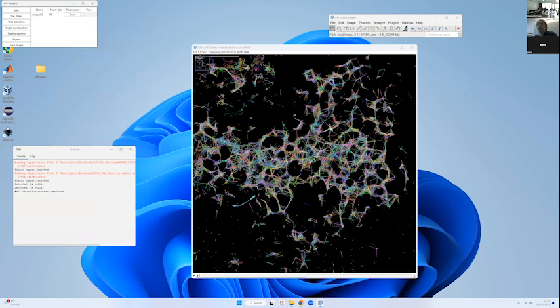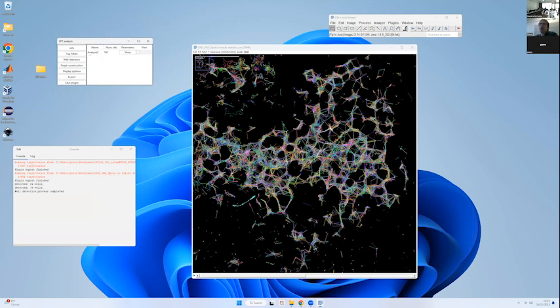And now if I go to the main menu, I have my analysis 0 here. Num elements is the total number of wells, so 160. If I click on show for the parameters, it will just open a window with all the parameters that I used in the algorithm. That's if you want to double check later.